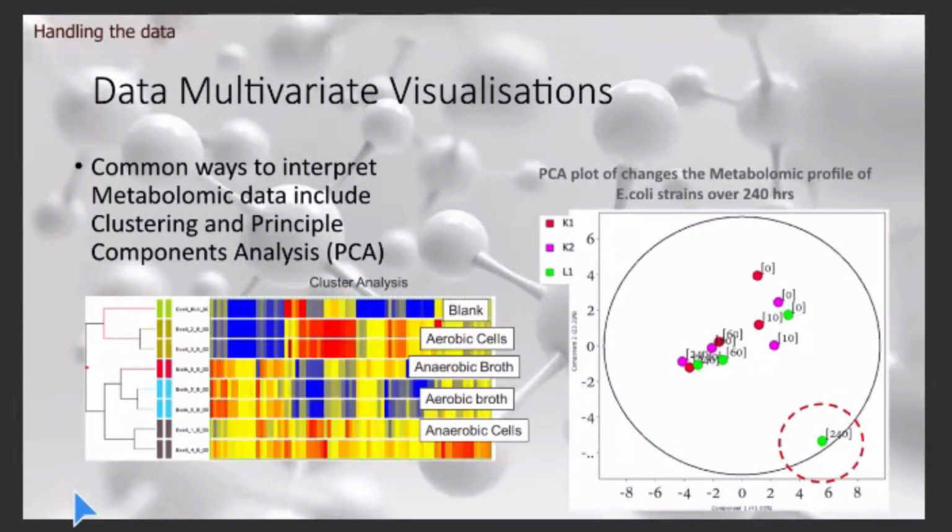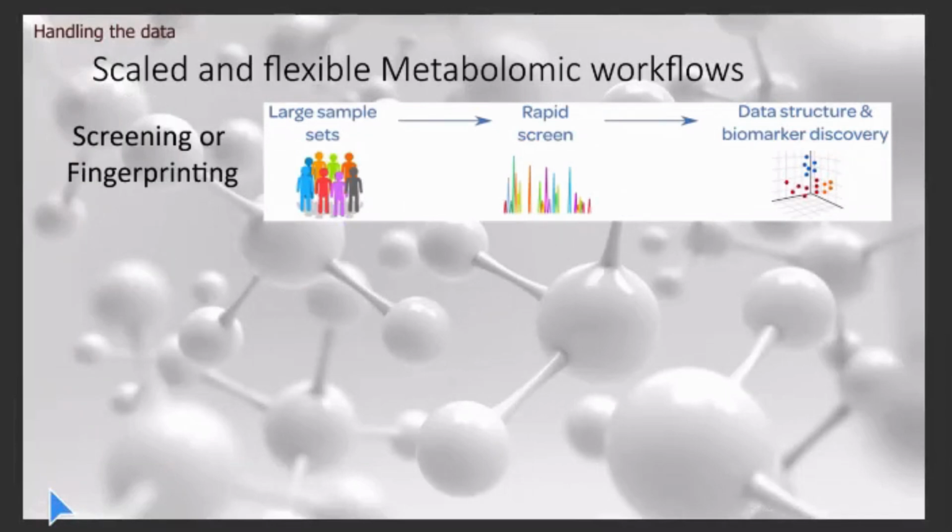And it's this workflow that delivers biomarkers of interest, for example, for process control or for clinical studies or for anything. So we move from needing to understand how everything changes to how just a few metabolites are the most important ones affecting the process of interest, and we do that via the multivariate or other types of statistical modelling to essentially filter that data out.